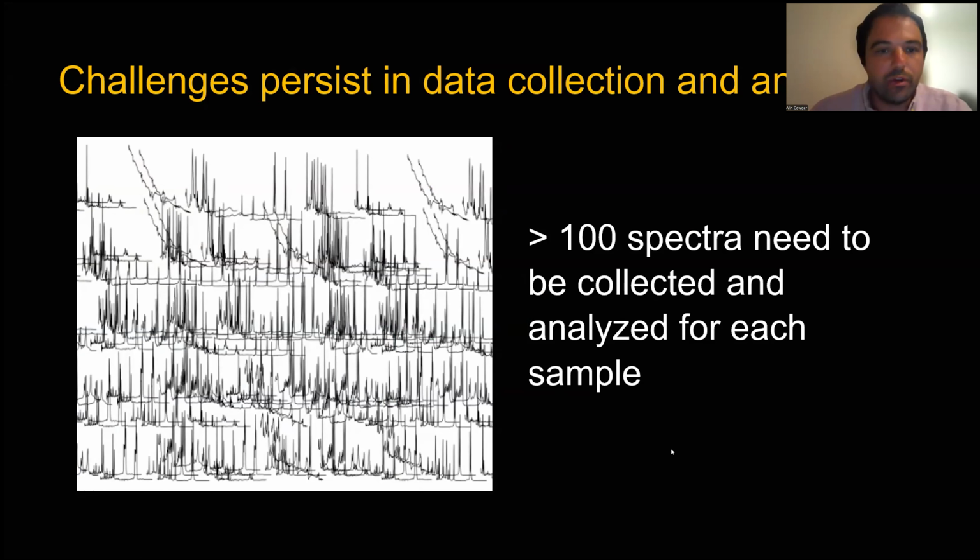Thank you. So in microplastic analysis, the main analytical data that we deal with very often is spectra. IR spectra and Raman spectra are two of the main techniques that are employed. And typically we have hundreds of particles at least per sample. So that'll give us hundreds of these spectra.